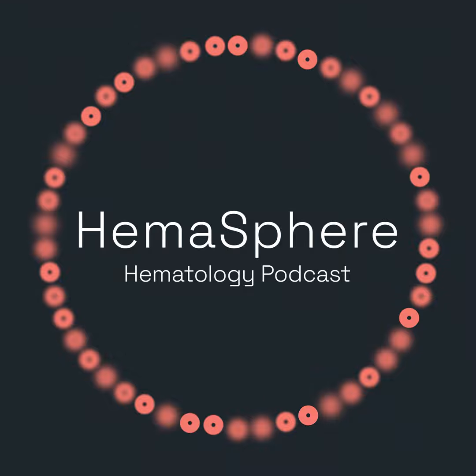Yeah. Fortunately, we're saying that, do we see an end to flow cytometry? And we mentioned at the very beginning, in the NGS space, those costs are kind of high and probably a barrier to rolling out for most labs. Do you think flow cytometry will continue to have a place if NGS costs come down, or will the time it takes to do the sequencing always be, flow is so immediate that's the advantage? Or, well, again, maybe it's a hybrid where you have both. You have, okay, here's the initial one, and then we do the NGS as well to confirm. Or what are your thoughts on the role of NGS versus flow for MRD?